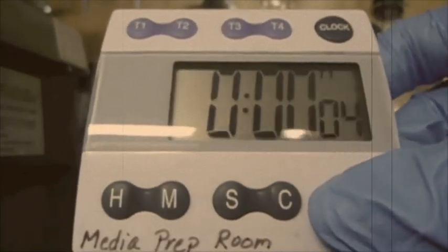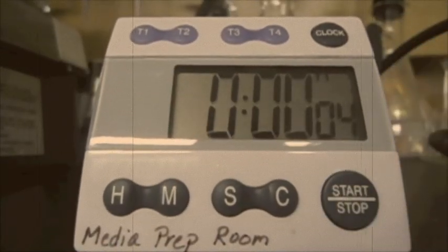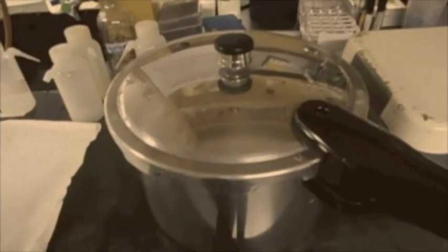After 30 minutes, your solution will be sterilized. Remember to always use heat gloves when removing your beaker from the pressure cooker.